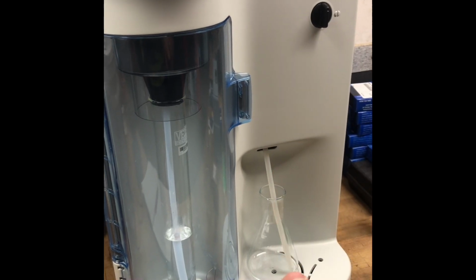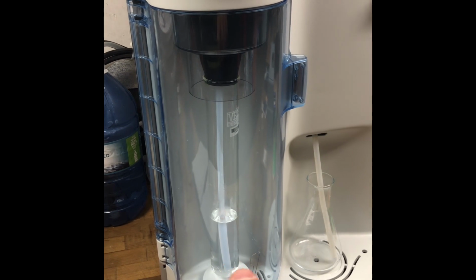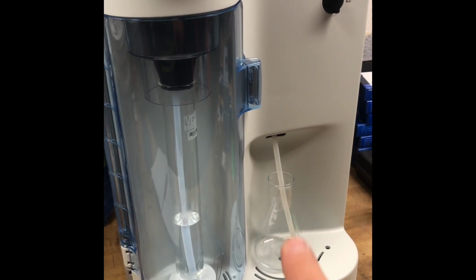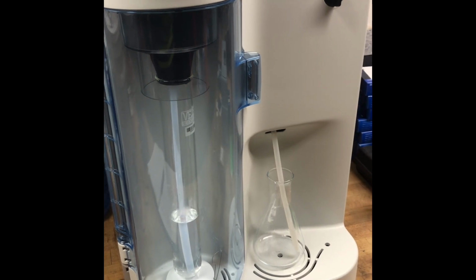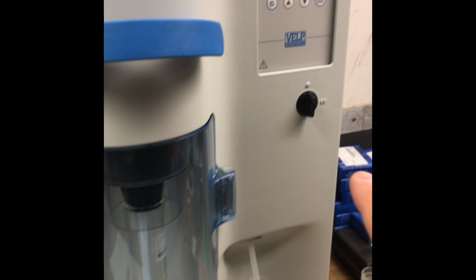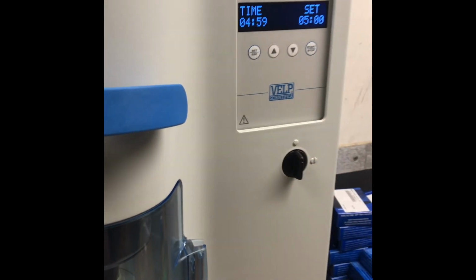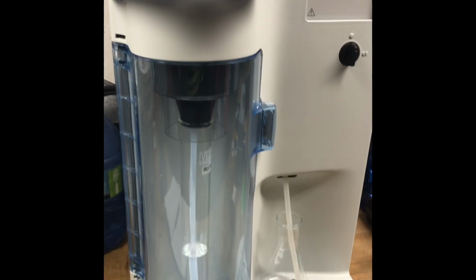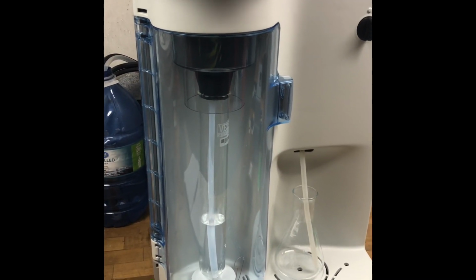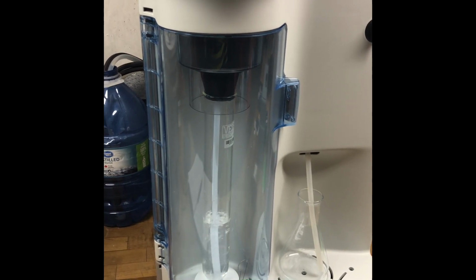some distillate over here. So I'm pre-measuring the amount of sample I'm using first, and I'm also weighing the amount of distillate collected to correct the numbers that I receive for weight differences. So all I have to do is press the start button, and it'll start a 5-minute timer where it will distill that sample for 5 minutes. So in a second now you'll see the bubbles start there as the steam starts to generate.